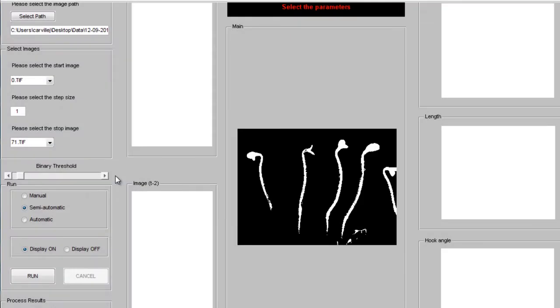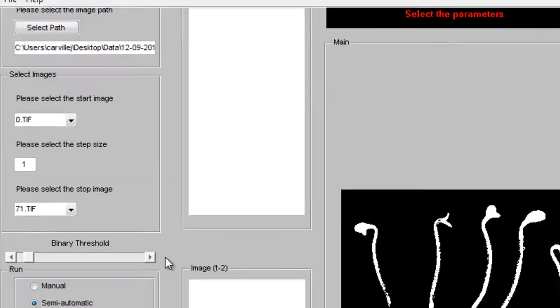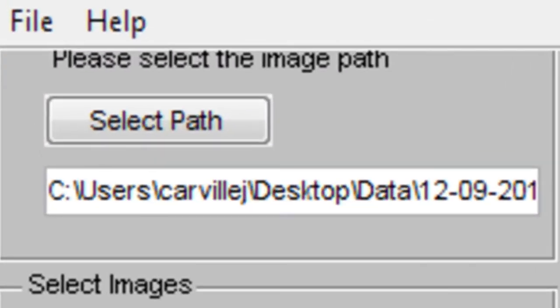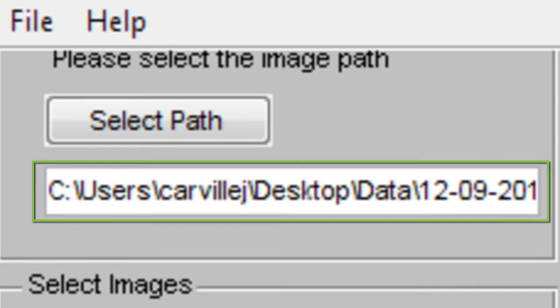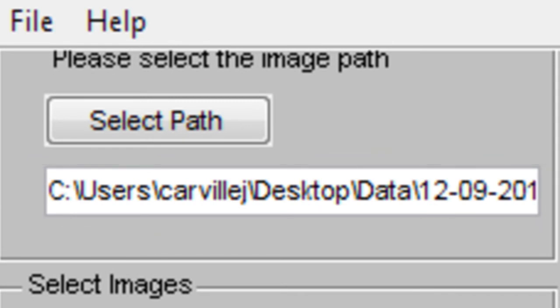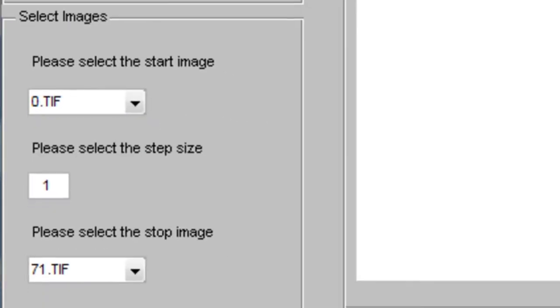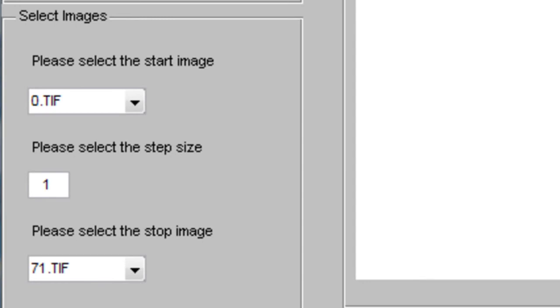When you have a high-quality image stack, you can open Hypotrace and select this image stack for analysis. Click Select Path, and then choose your image stack. After loading your image stack, select the range of images to be analyzed.